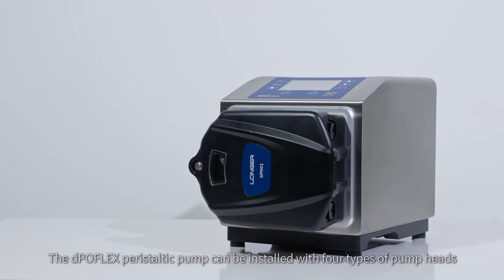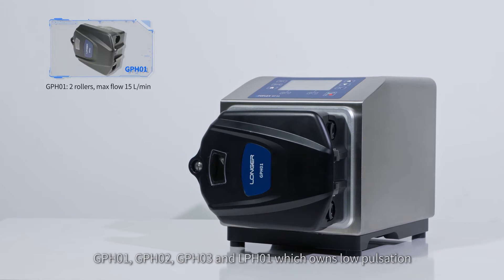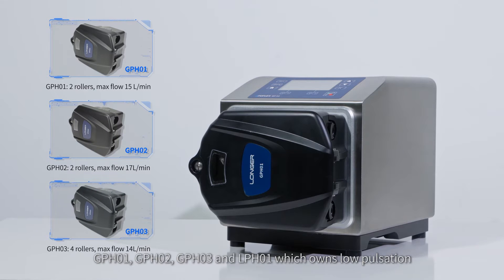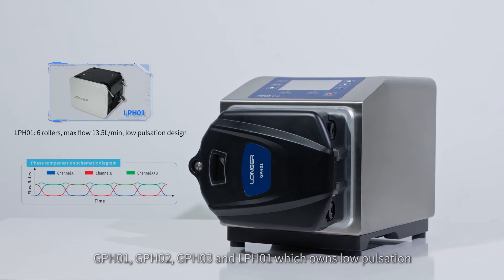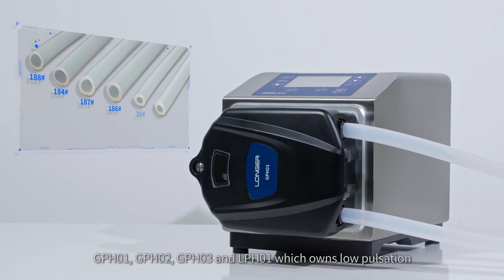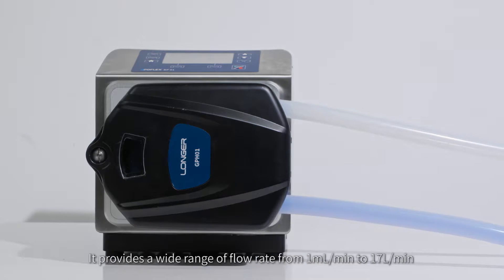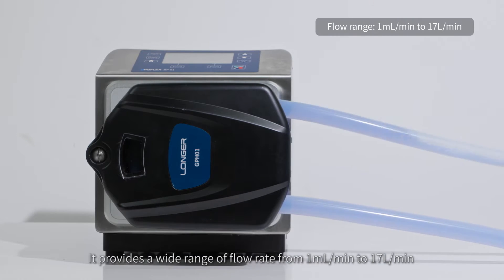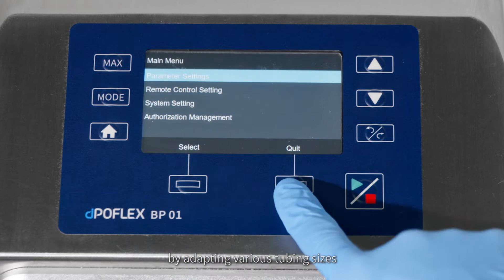The Depoflex peristaltic pump can be installed with four types of pump heads: GPH01, GPH02, GPH03, and LPH01, which offers low pulsation. It provides a wide range of flow rates from one milliliter per minute to 17 liters per minute by adapting various tubing sizes.